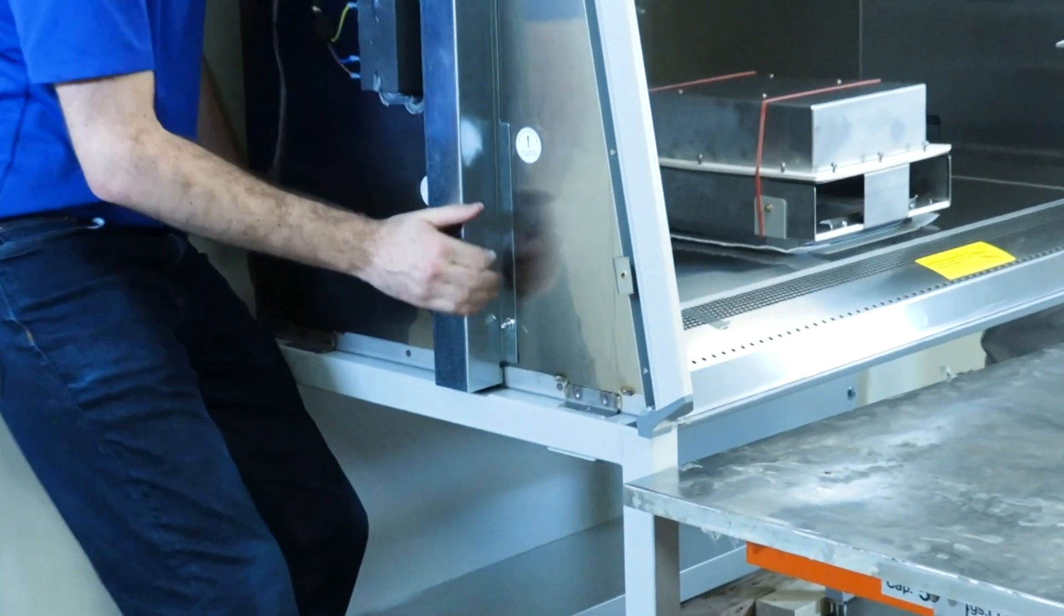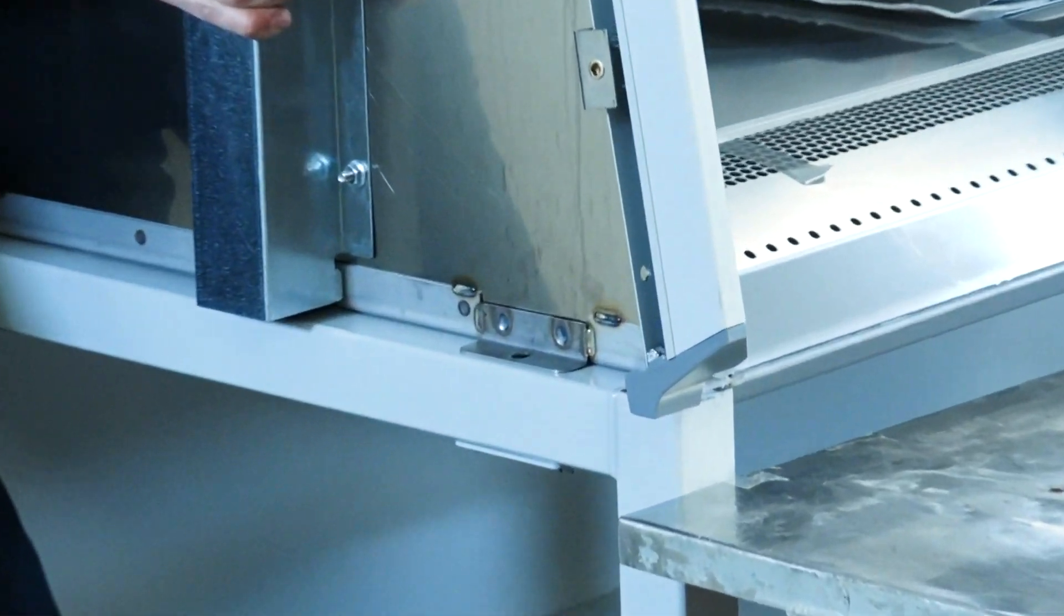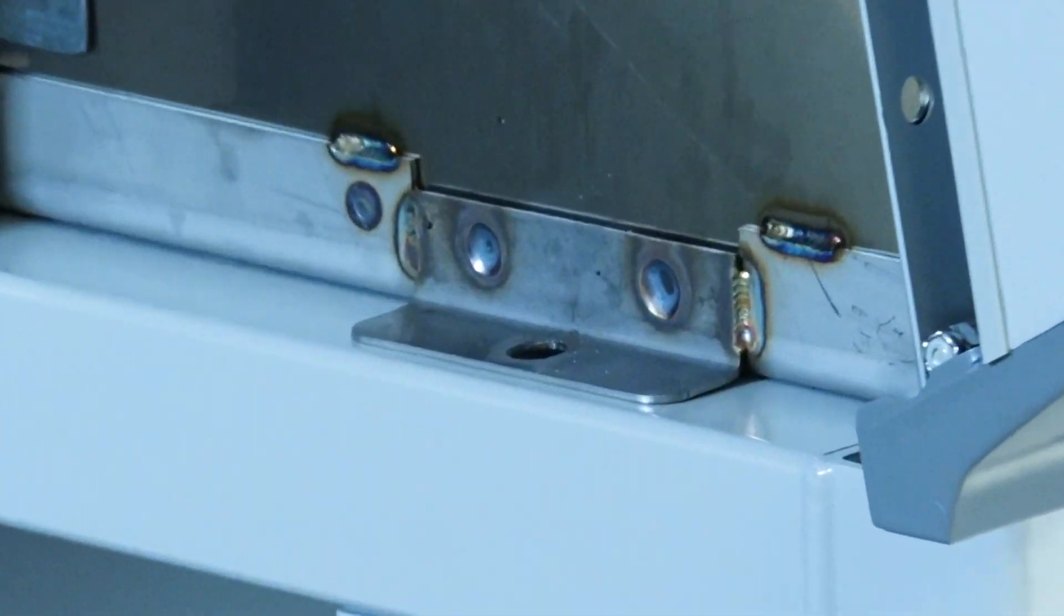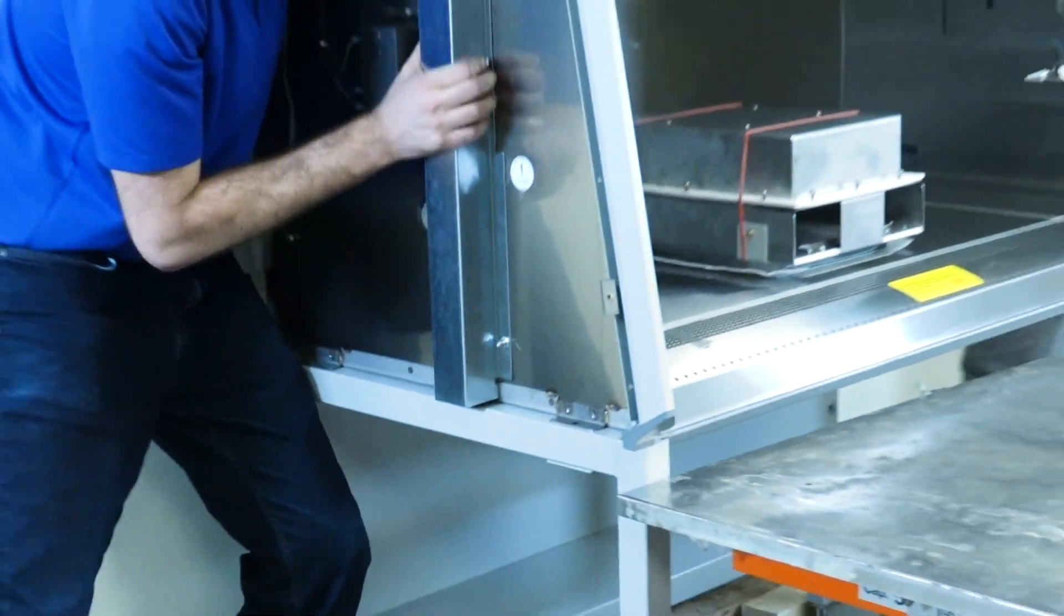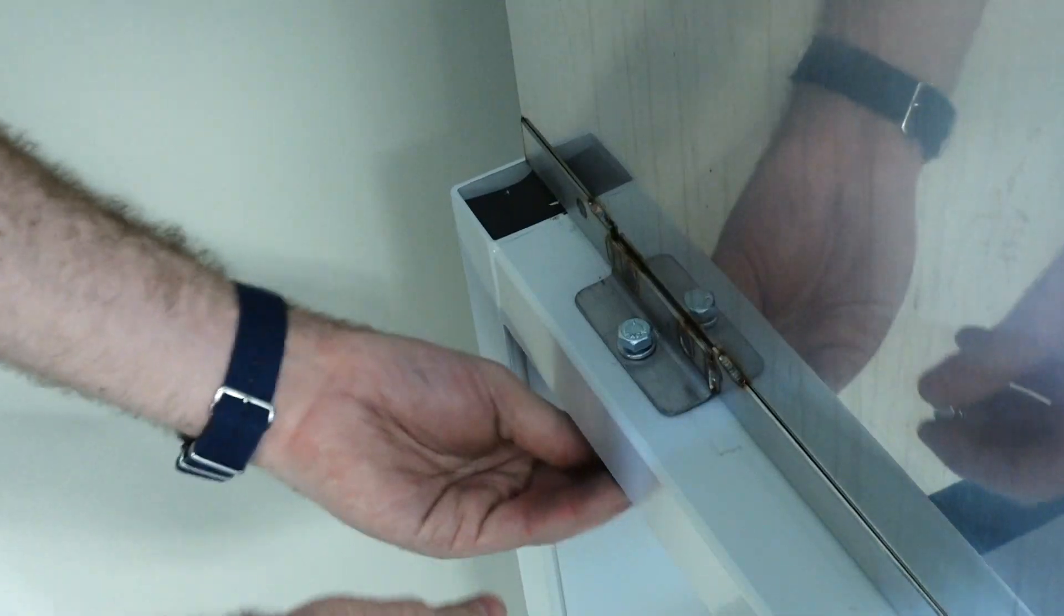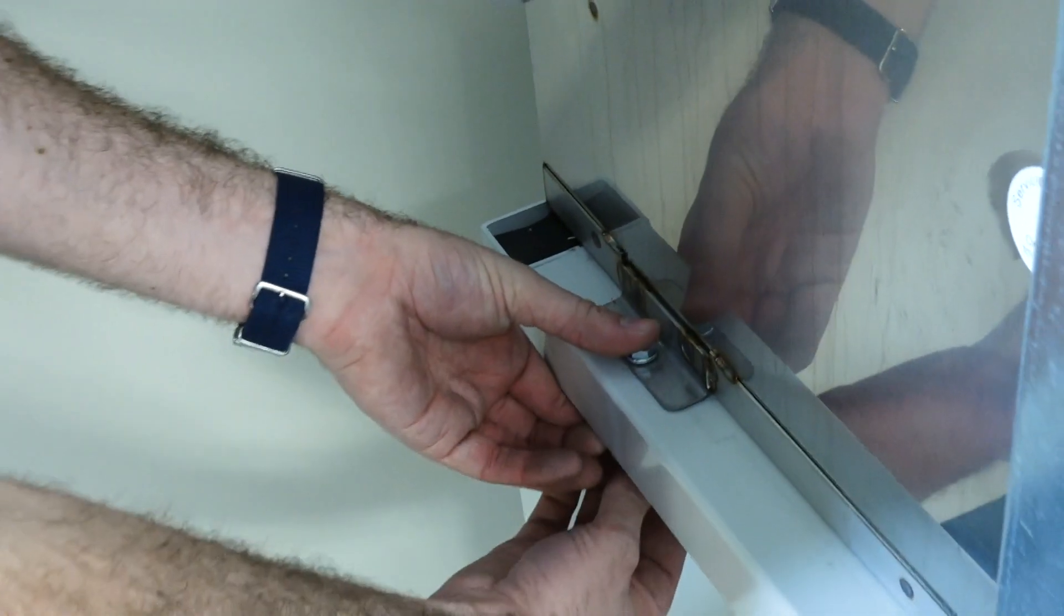Next, line up the mounting holes of the stand with the mounting holes used to secure the biosafety cabinet during shipping. Secure it to the base stand using the four bolts that mounted it to the shipping pallet.